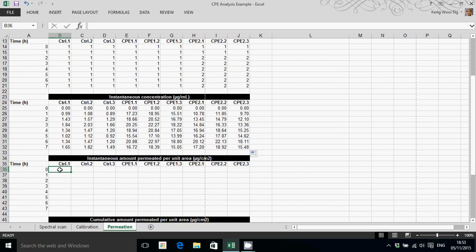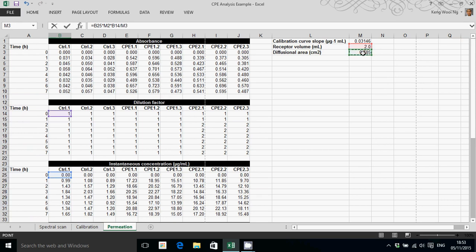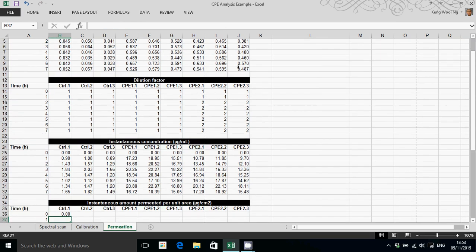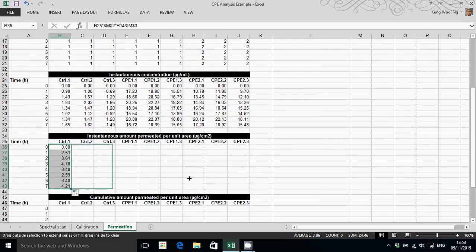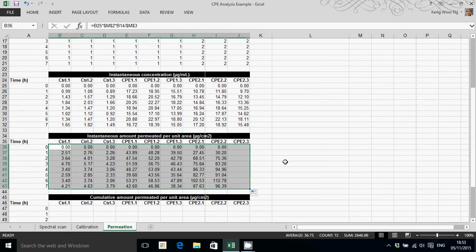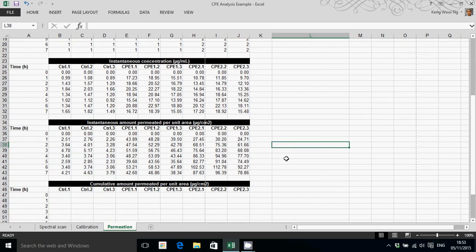Now this is simply the instantaneous concentration multiplied by the receptor volume, multiplied by the dilution factor, and divided by the diffusion surface area. Again, I will fix these cell references and do that for all of the cells, all of the samples. So that's the instantaneous amount permeated per unit area.